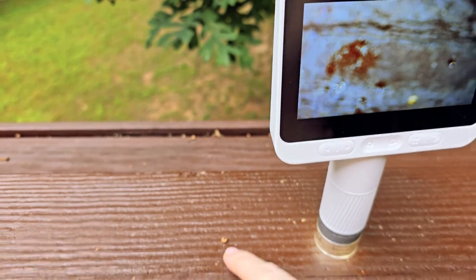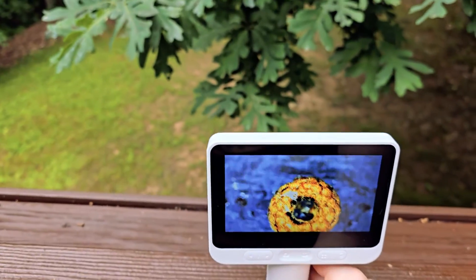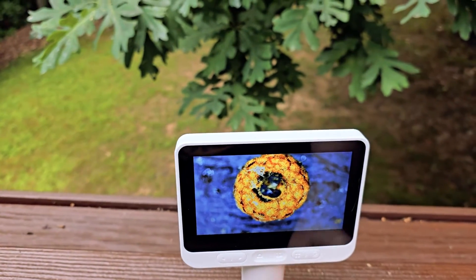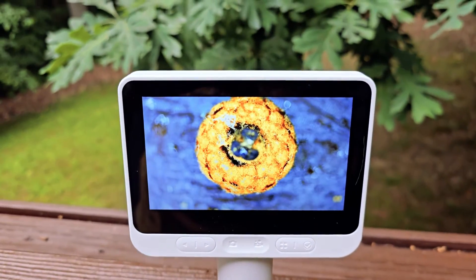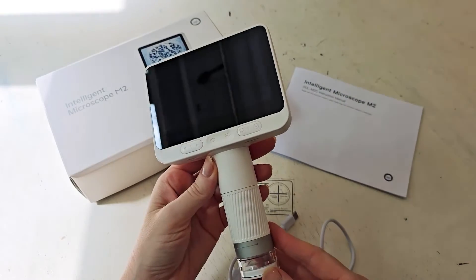Before I even break out the box and show you everything, I just first want to show you this in use really fast. This is a little tiny seed that was outside — look at this clarity, look at what you can do with this product. So now that you've seen what it can do, let's go ahead and jump in.